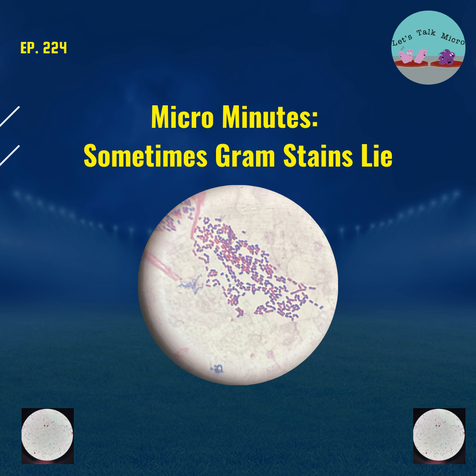And there are a couple of ways that you can do that, which is applying the decolorizer and then counting 3 to 5 seconds, or holding your slide vertically and adding your drops for 3 to 5 seconds. But keep in mind, if you have a very thick smear, then you're adding more decolorizer, right? Because the objective is when you add decolorizer, you're looking at the purple, you're watching it wash away. And if you have a very thick smear, that whole process is going to take longer, resulting in maybe an over decolorized sample.